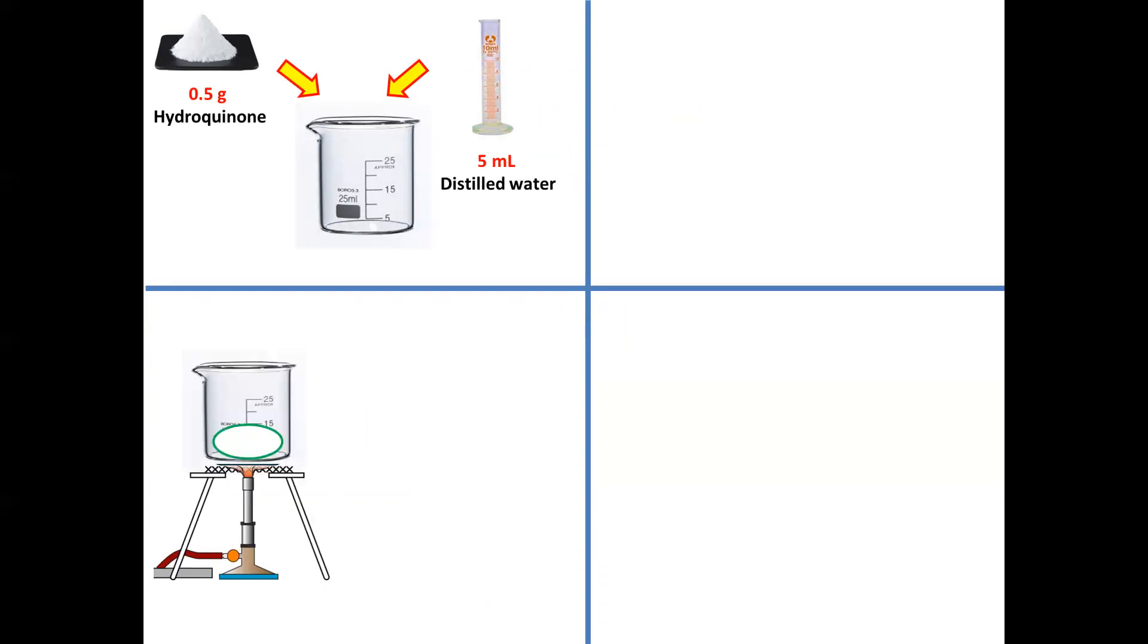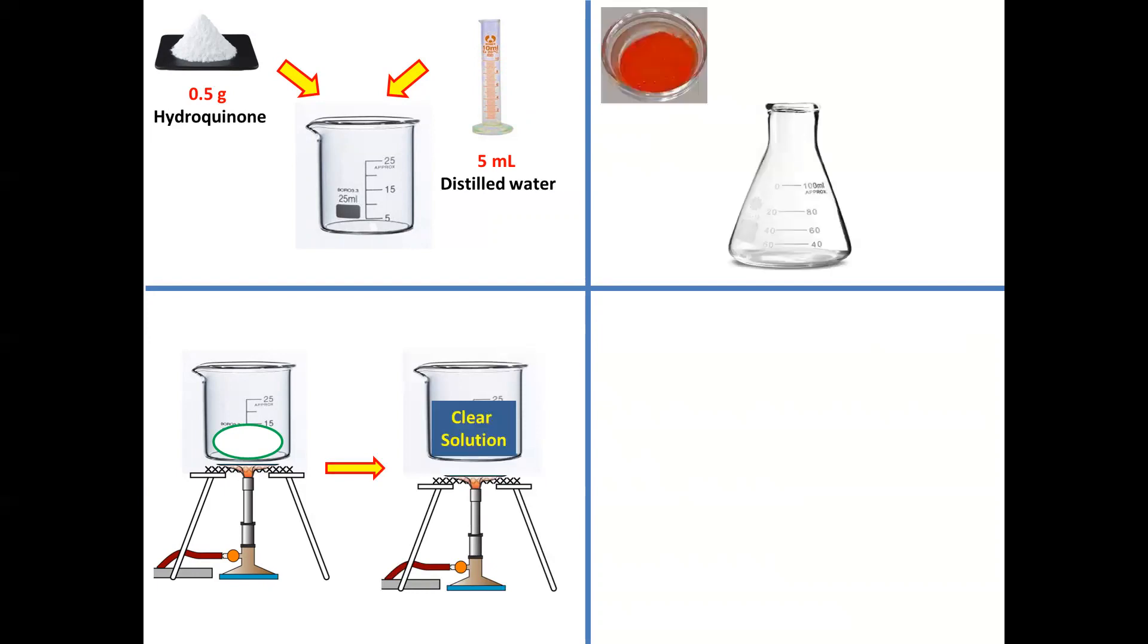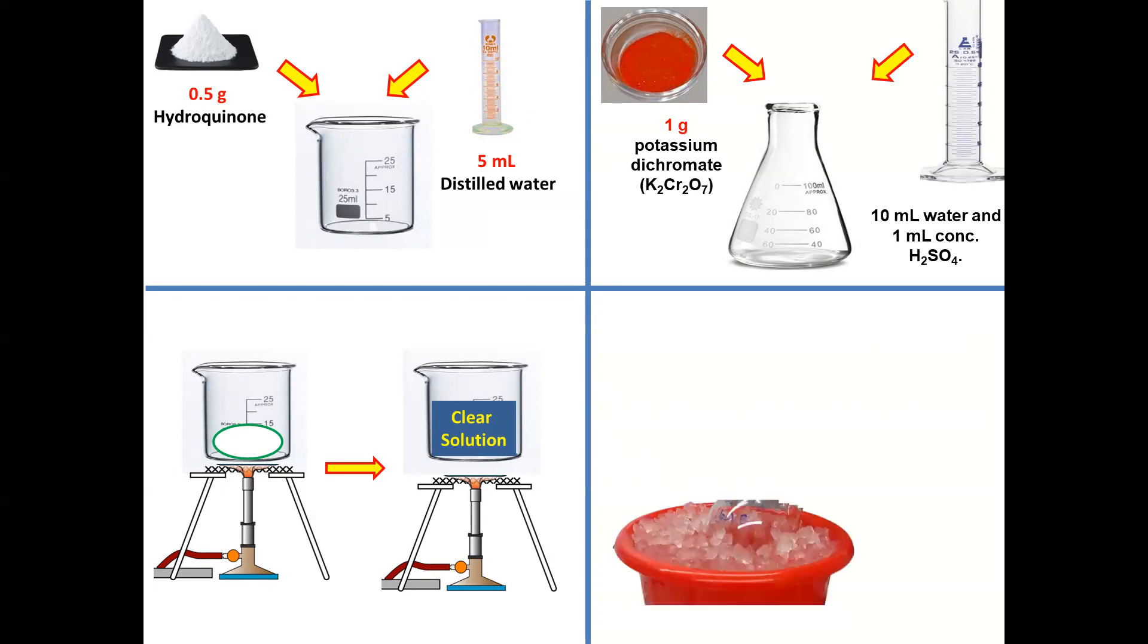Now heat the beaker on a wire gauze to obtain a clear solution. Now add 1g potassium dichromate in the conical flask.